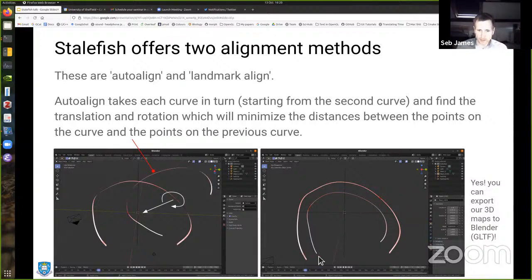And by as close as possible, I take 100 points around each of the curves and compute the sum of the squared errors between the positions of those. That value is minimized, and the optimal rotation and translation is found to minimize that error. That's applied to each of the slices throughout the data set, and that arranges the curves fairly well.